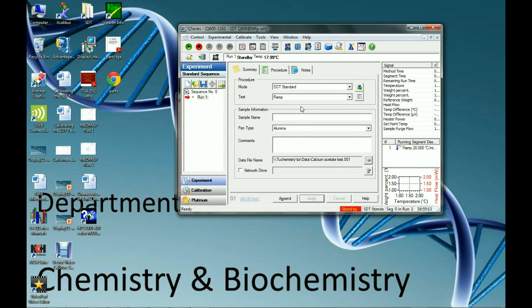And we'll just save it in the data folder underneath the TA and TU chemistry folders. Okay, so now that we have that done, let's go ahead and look at our procedure.